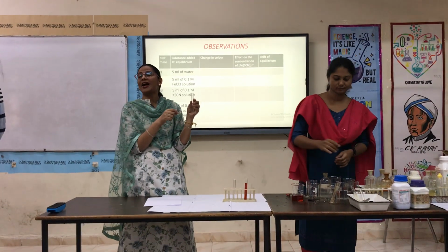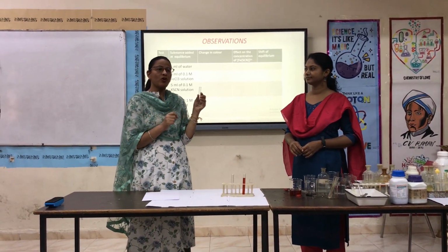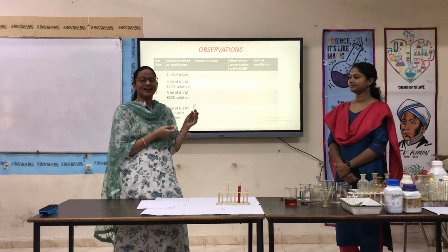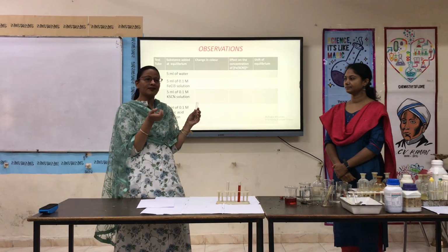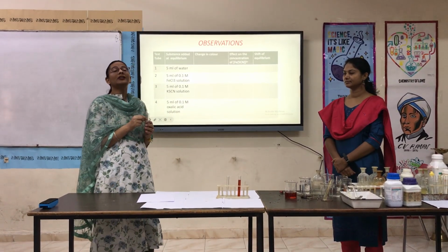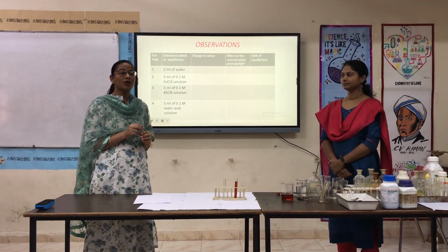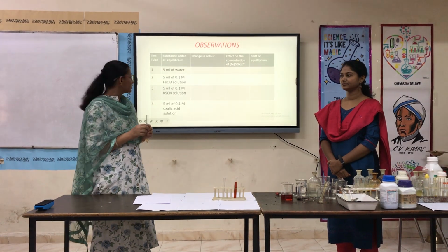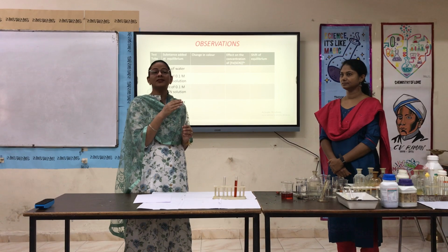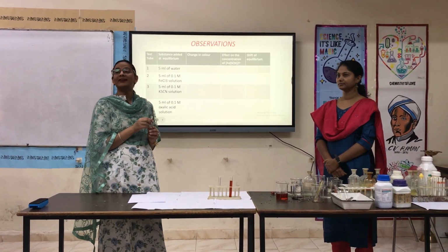The solution which we add is the solution of oxalic acid. It means there is some role of oxalic acid. Oxalic acid is not there in our reactants, yet now we are adding it. So what is oxalic acid doing? It is forming a complex with ferric ions, thereby reducing the concentration of ferric ions in the solution. Since the concentration of a reactant, ferric ions, is decreasing, equilibrium is shifting towards the backward direction, that is towards the reactant side.